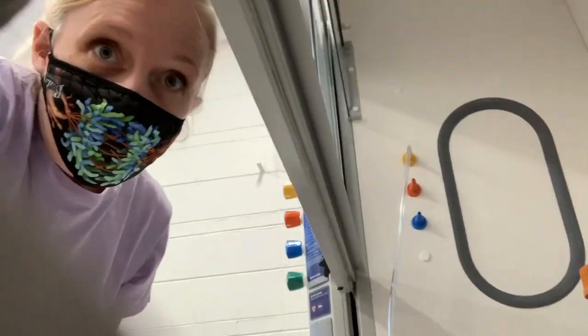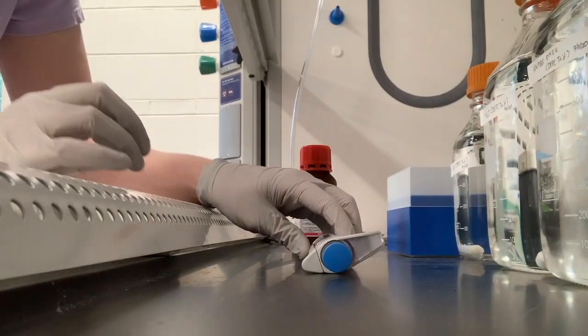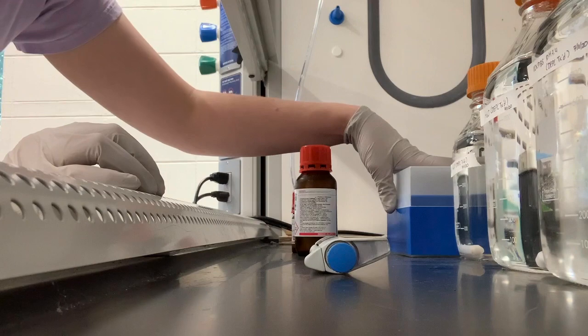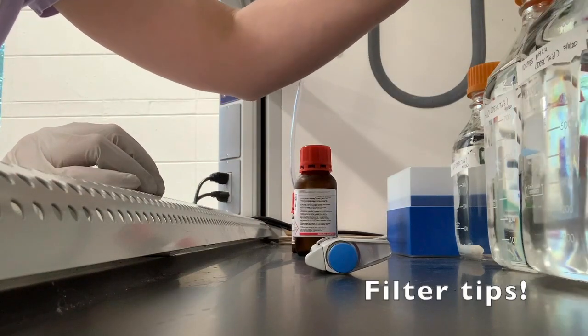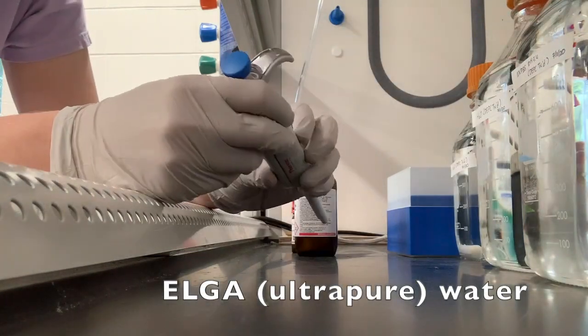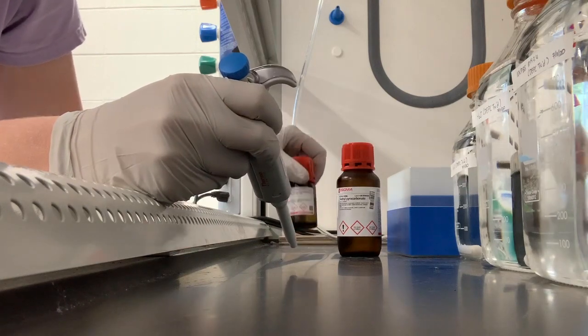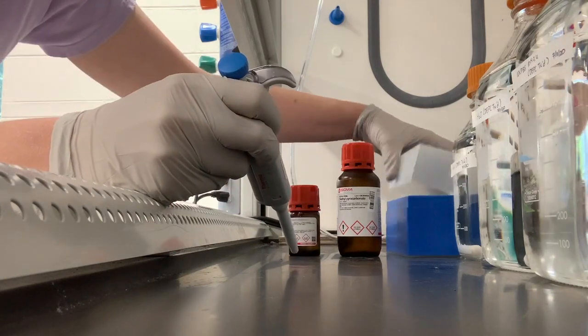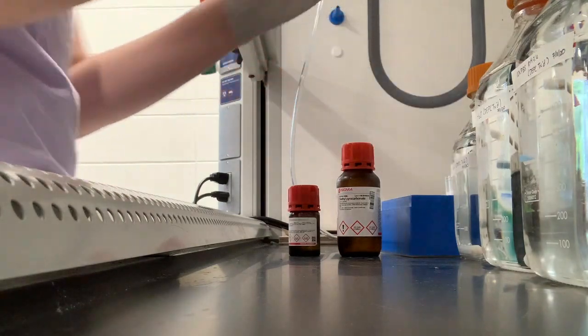So now you're in the chemical hood. In this chemical hood, I have my P1000, my tips, and these solutions. So this is my 10x PBS and then some bottles of water of different volumes. And I'm going to pipette this Dep C into each solution at that 1 to 1,000 ratio.